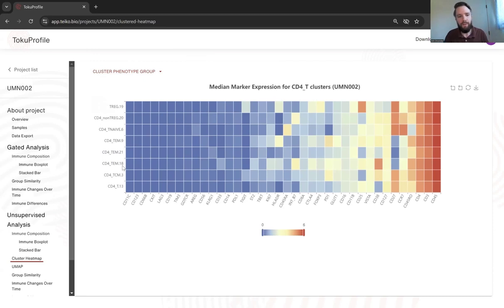And what's interesting about this, when this sort of thing happens, is that you can look at the heat map and figure out, okay, why do these cell types, even though they all resemble T effector memories, differ such that our algorithm splits them into 3 clusters instead of 1? It seems to be driven a lot by certain markers being expressed: HLA-DR, PD1, CD25. So in general, when this happens, we're looking at perhaps a subset that's activated compared to the other cells within the same category, or cells that might be exhausted. There are lots of different interpretations you can make about why these clusters separated.